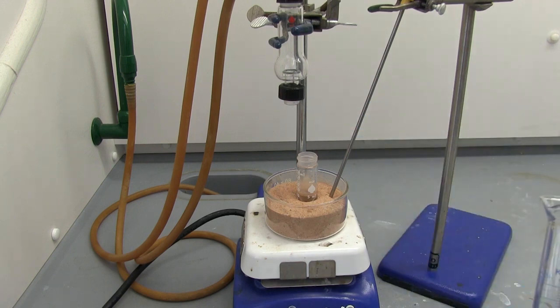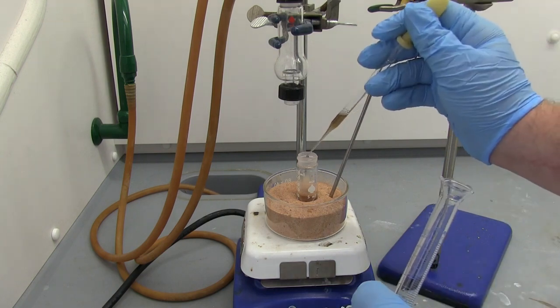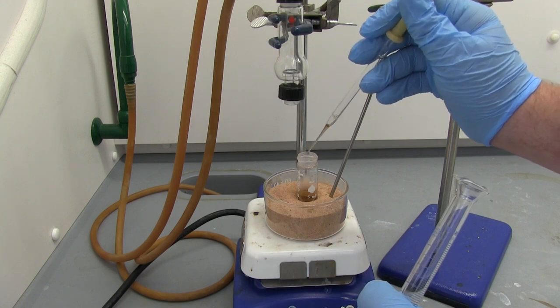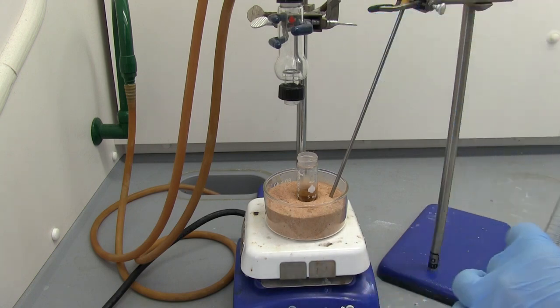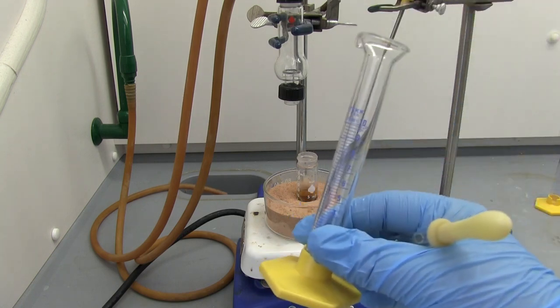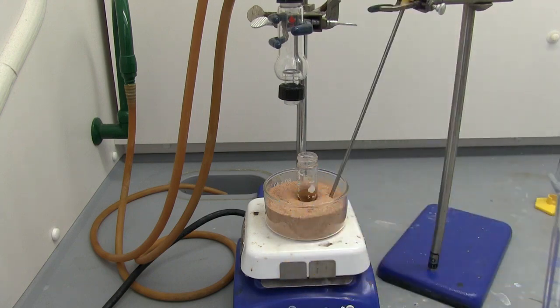Now we're going to slowly add our half mil of sulfuric acid. Next we're going to add our 2-methyl-2-butanol. So a mil of the 2-methyl-2-butanol, again we're going to add it in.